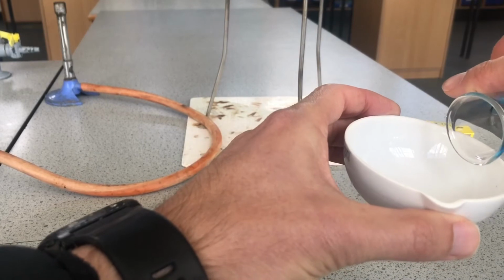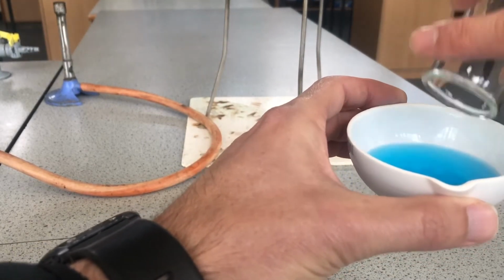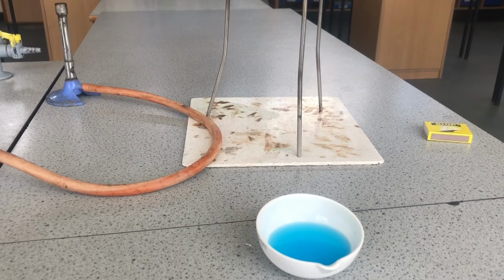We've now finished that filtration, so we'll take the copper sulfate solution out of our flask. We're going to pour it into an evaporating basin, because the last stage is to evaporate the water from that copper sulfate solution. To do that, we're going to heat it on a water bath on a Bunsen burner. We're going to use a water bath because when you heat salt solutions like this, the water evaporates off very nicely to start with, but when they get quite concentrated, especially if you're heating them quite strongly, towards the end, they can start to spit out, and that can be a little bit dangerous. So if we heat it on a water bath, it's a bit more gentle.